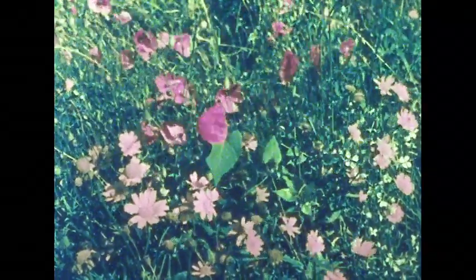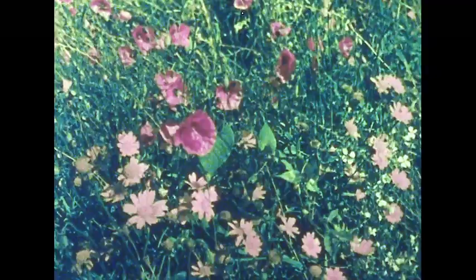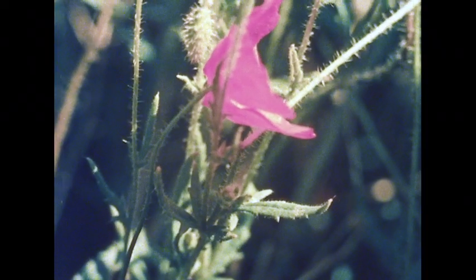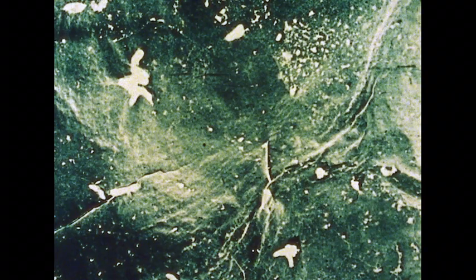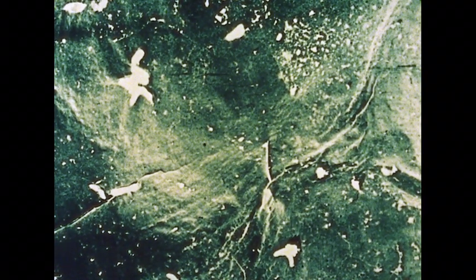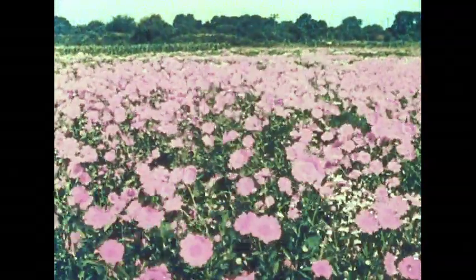The botanist, studying the effect of weed killers, takes different weeds and makes replicas of their leaf surfaces. The leaves of poppies and many other weeds have a surface which is porous to liquids. But the corn marigold has an elaborate structure of wax on the leaves, which makes them waterproof. This may explain why the marigold is immune to contact weed killers.